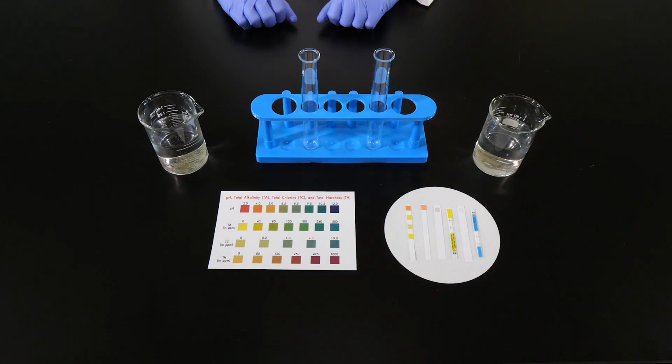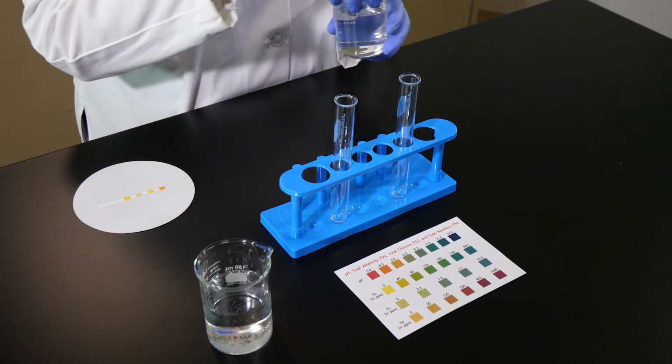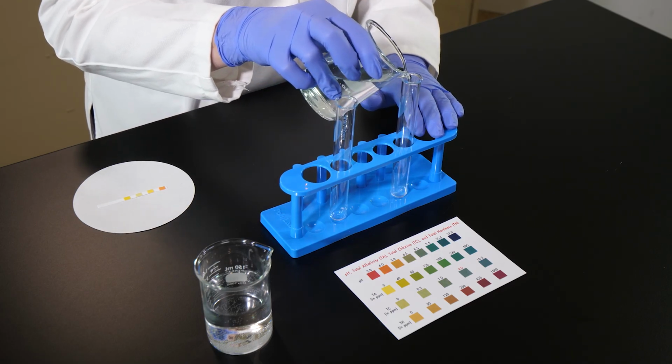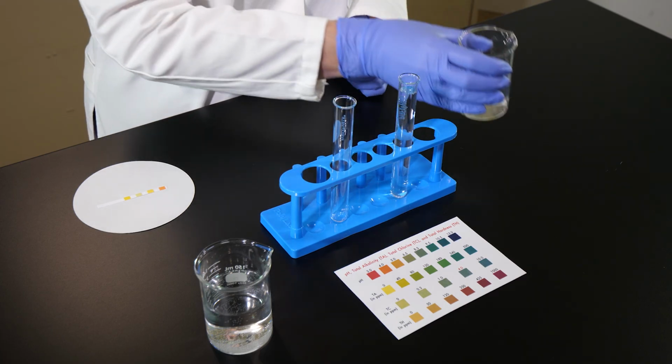We will now test a sample of our source water to determine its pH, total alkalinity, total chlorine, and total hardness. All 4 of these qualities are measured with 1 test strip. To avoid additional contamination of our sample with our test strips, we pour a small amount of the source water into a test tube before we perform each test.